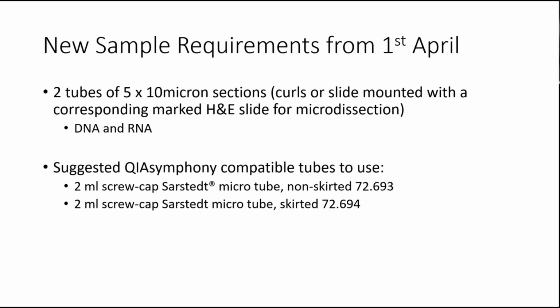An additional, I guess, best wish would be if it would be possible for these to come in a particular tube that is compatible with our QIAsymphony. That would be great because it avoids any transfer of material at our end, but that's something we can discuss individually with labs, and we can help support get those tubes into pathology labs for the material to be sent in if that was possible at all.